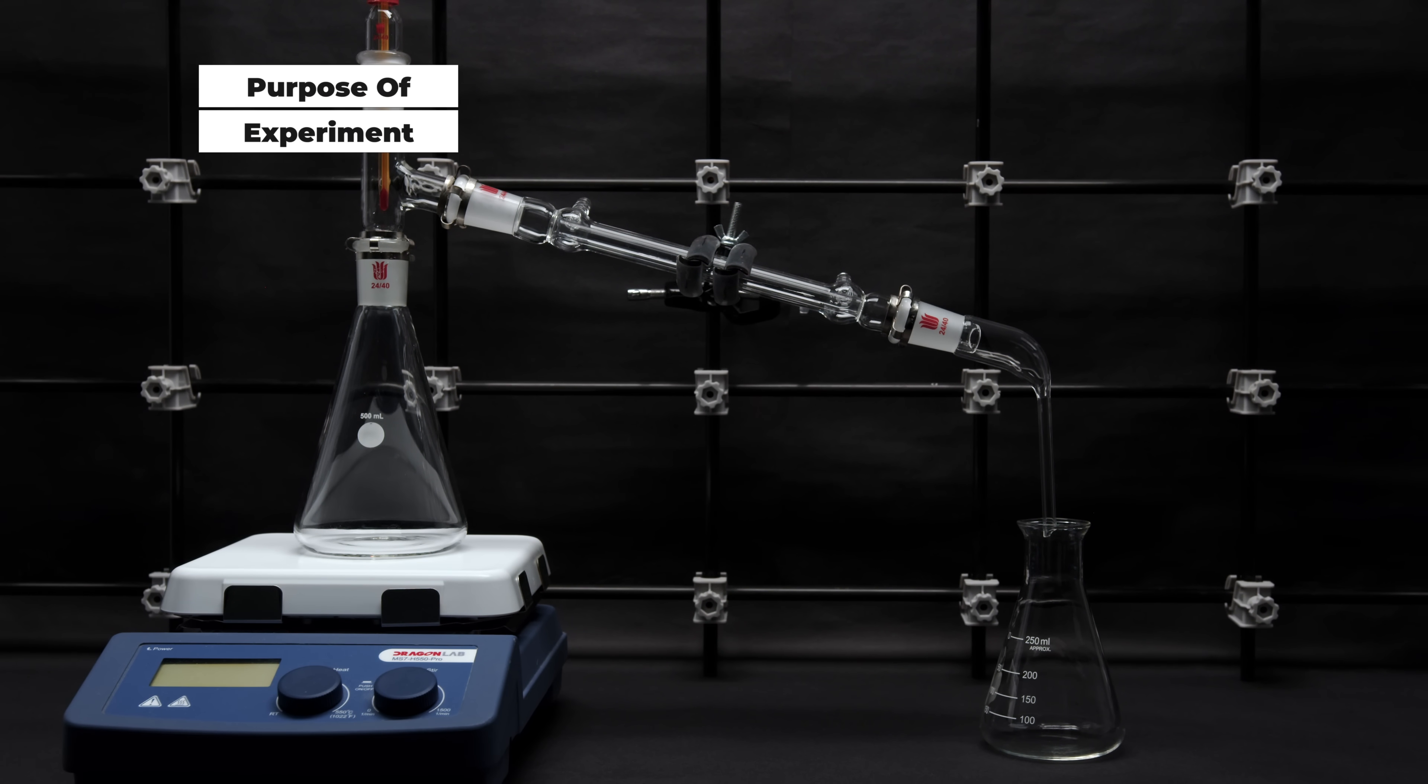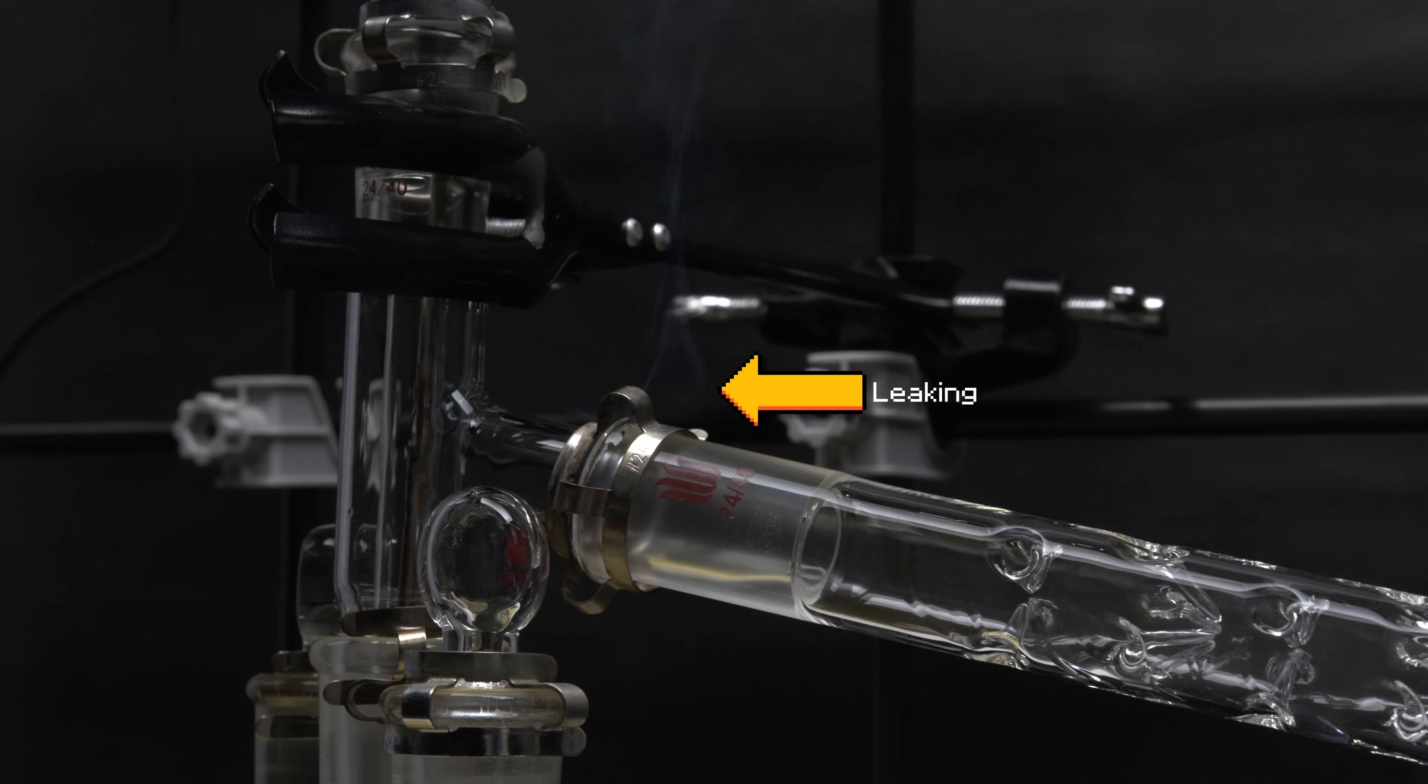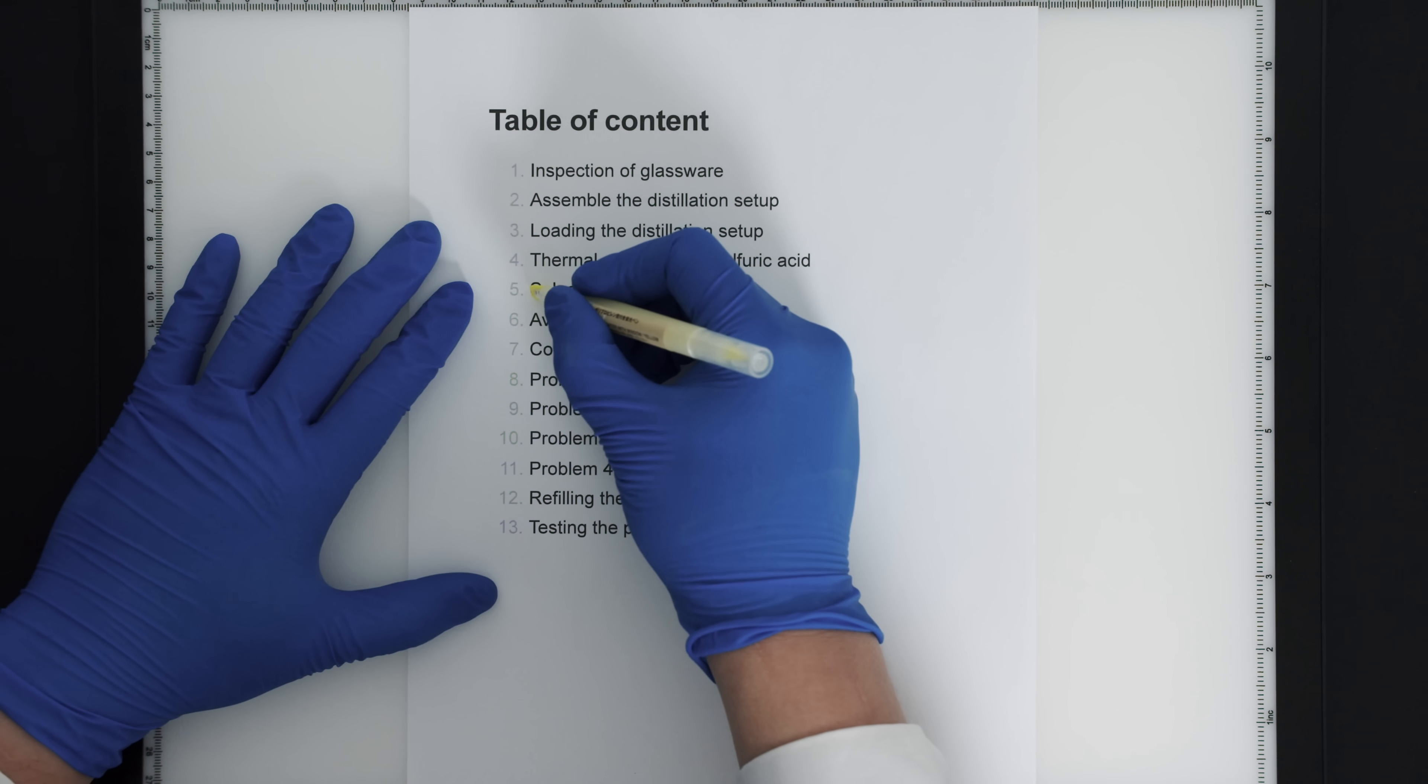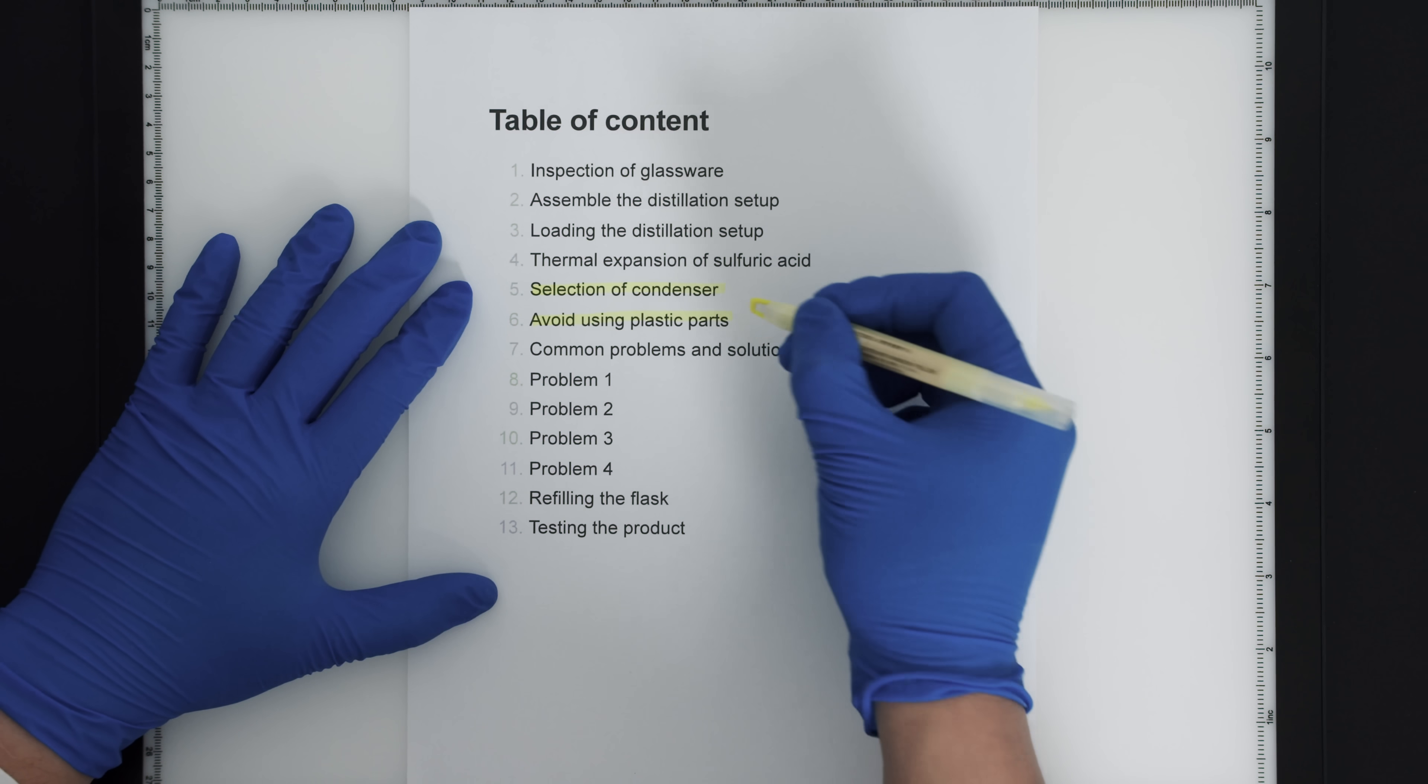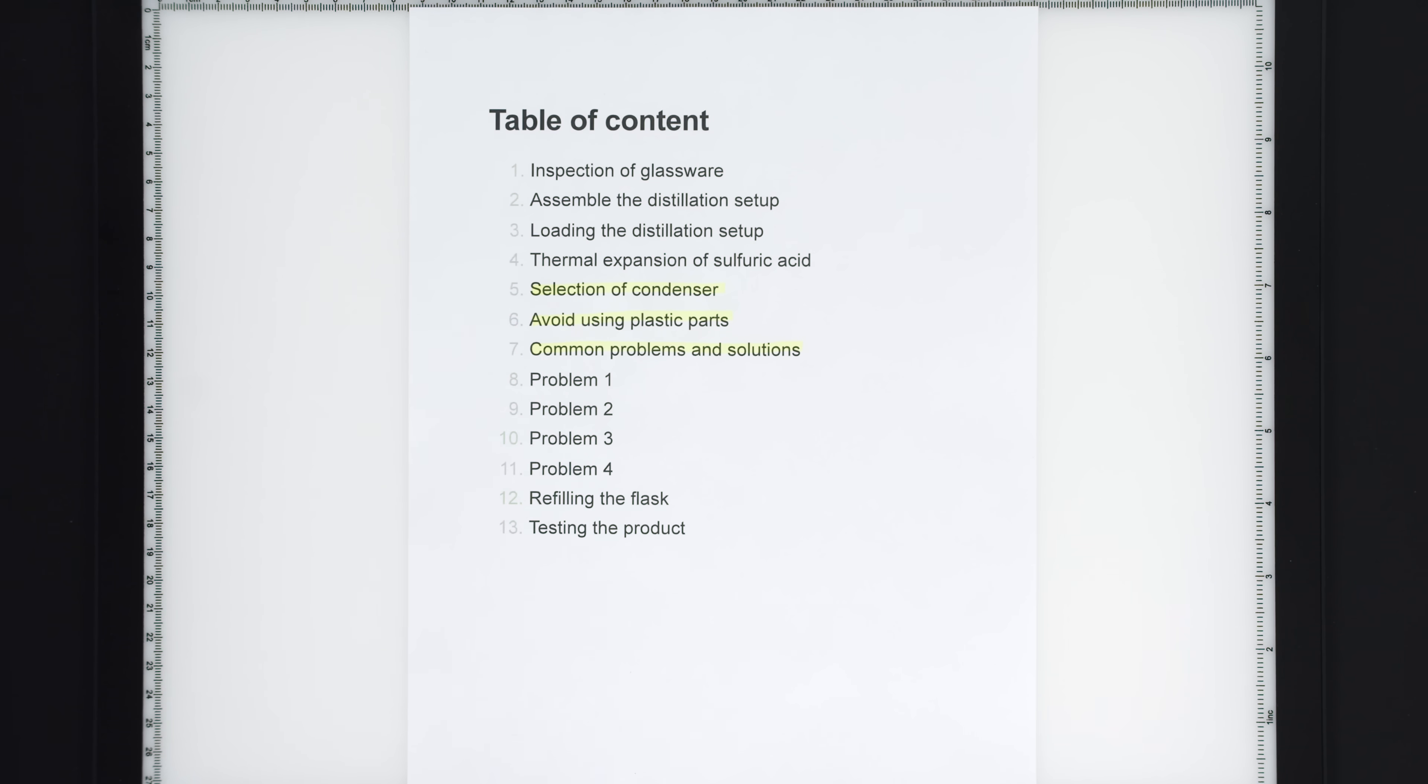If you think this is yet another distillation video and click away, hold up. The distillation of concentrated sulfuric acid is much more complicated than just simple distillation. There are 4 common problems associated with sulfuric acid distillation. However, there are combinations of factors which can't be addressed individually. But don't worry, I will give a detailed breakdown of every important bit I can think of about distilling concentrated sulfuric acid, including the why and the how.